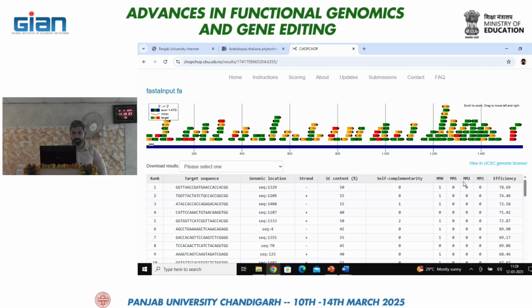These mm0, 1, 2, 3 represent, for example, that with 0 mismatches the target sequence binds to any other gene, that is, it binds somewhere else, not where it's supposed to be.